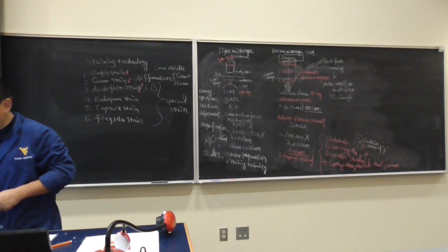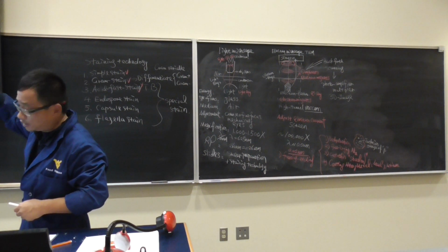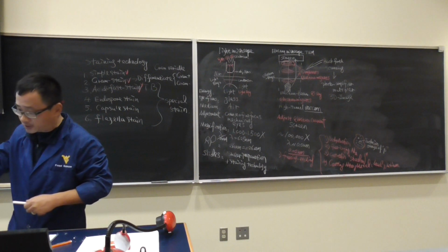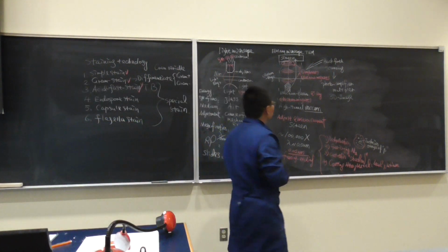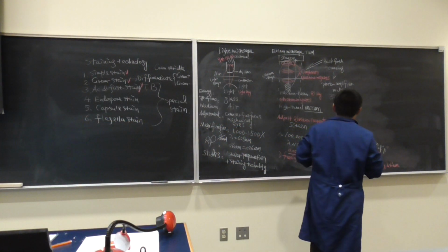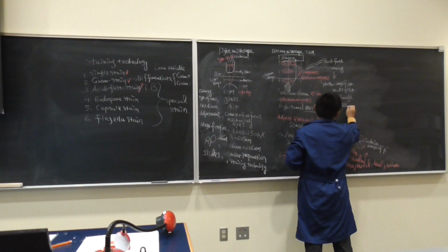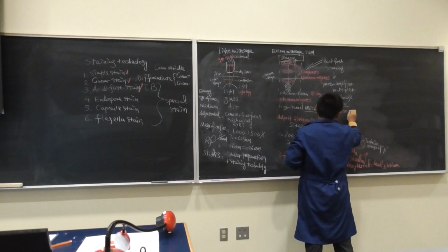And this is also another example. You can see what the scanning electron microscope looks like, but not the inside, not the inside like cell wall, nuclear, ribosome, all those things. So for the scanning electron microscope, the magnification usually is about 10,000. Some cheaper ones are even 5,000 to 7,000.